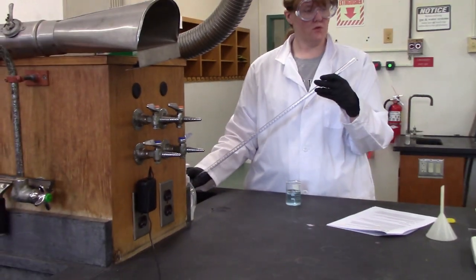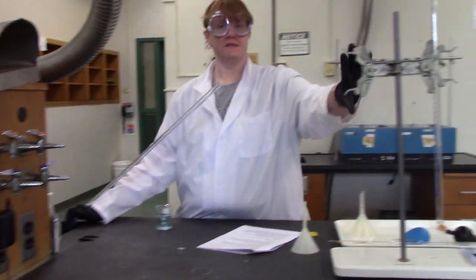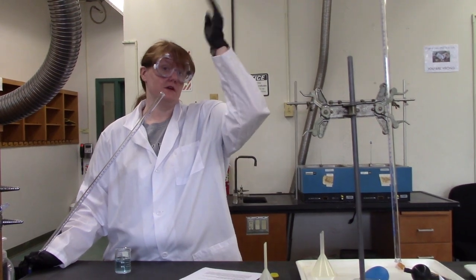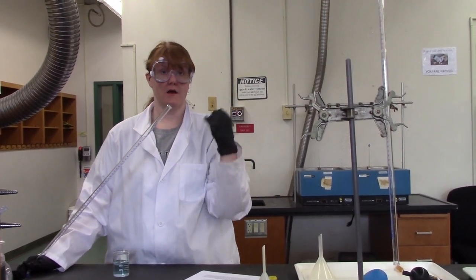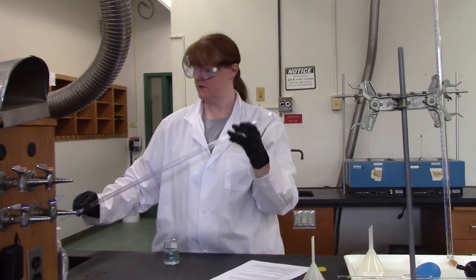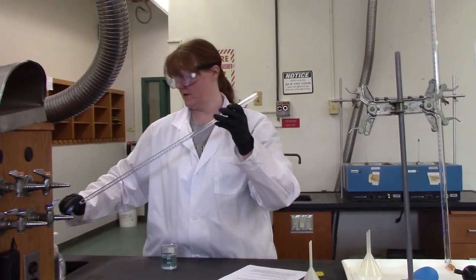So what I don't want to see is the buret on the stand and you trying to fill it above your head. That's not safe, because then the chemicals are above your head, you don't have as much control, and they're likely to come down on your face. And base on your face is bad. I feel like you could write a YouTube song about that.